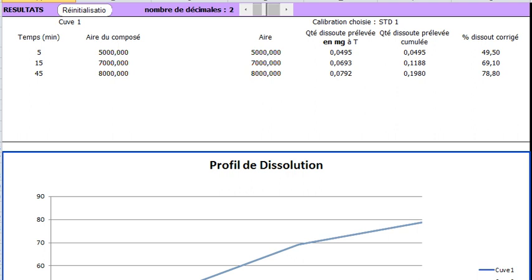Now we have to choose the calibration system. In this case, the only one available is standard 1. If we had made a second one or a third, they would be proposed here and combinations of them too.